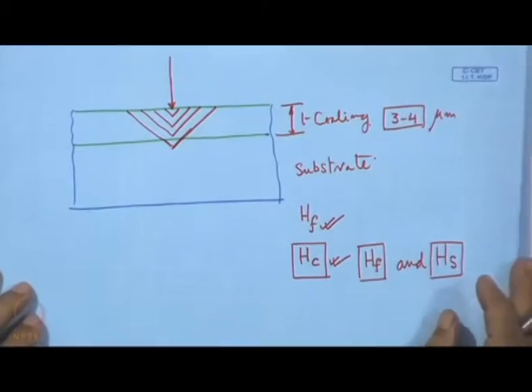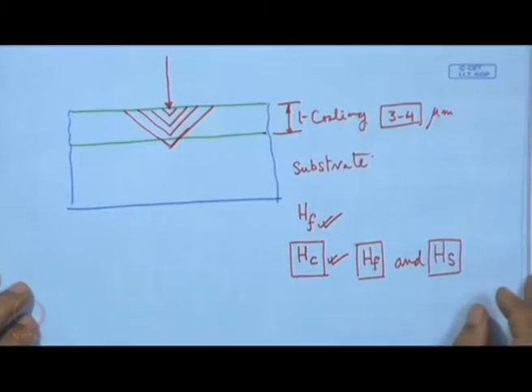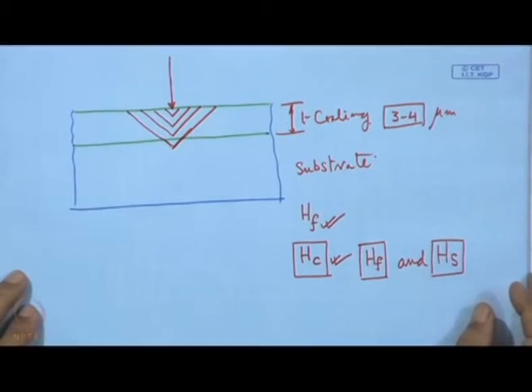Now, here two attempts have been made to model the hardness measured by this Vickers indenter or Vickers hardness tester, just by modeling this hardness of the composite.